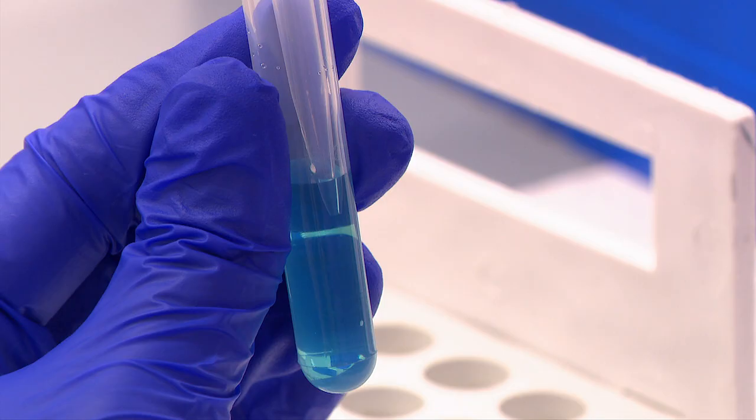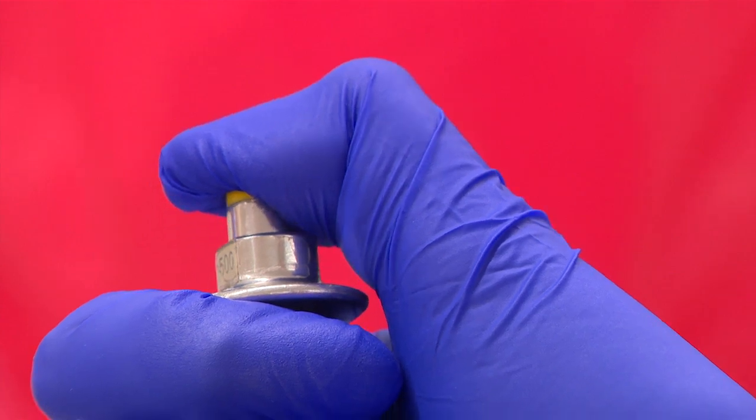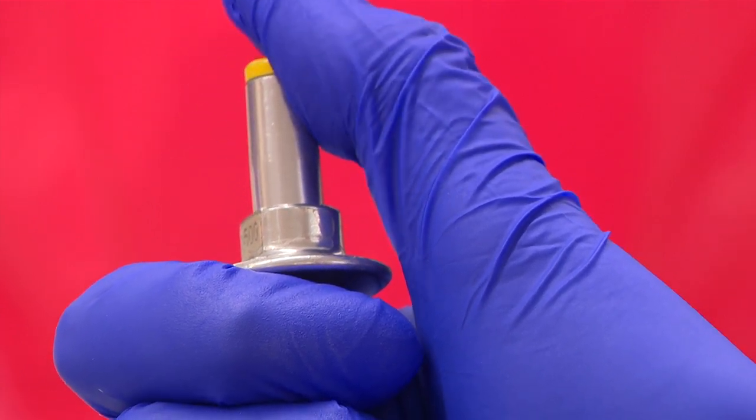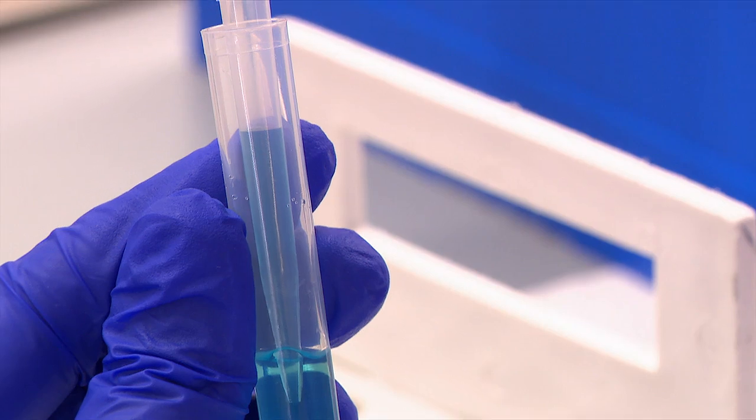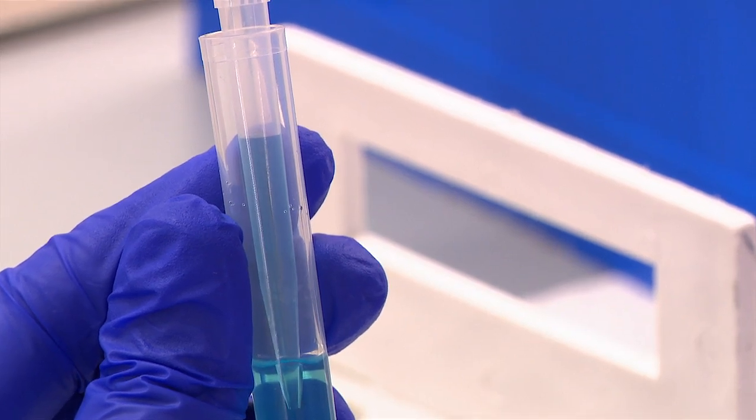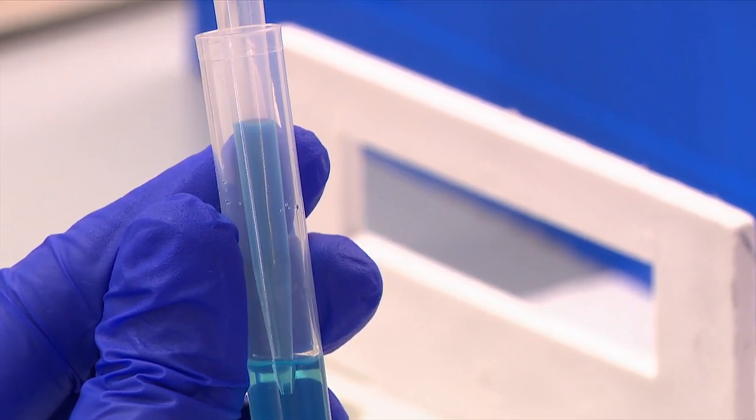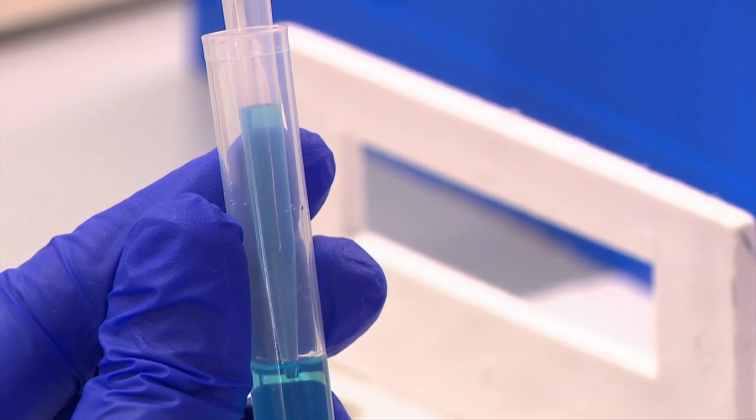Hold the pipette vertically and immerse the tip approximately 2 to 3 millimeters deep into the sample solution. Gently and slowly return the plunger button to up position. Pause for one second to allow the solution to enter the pipette tip. Do not let it snap back.